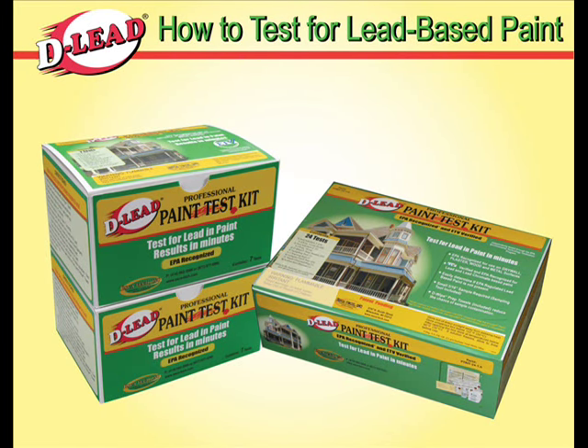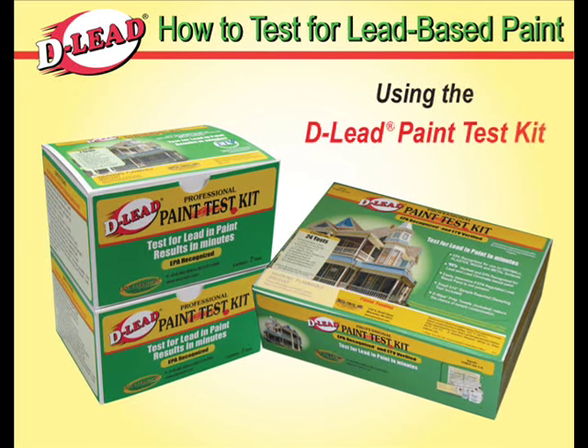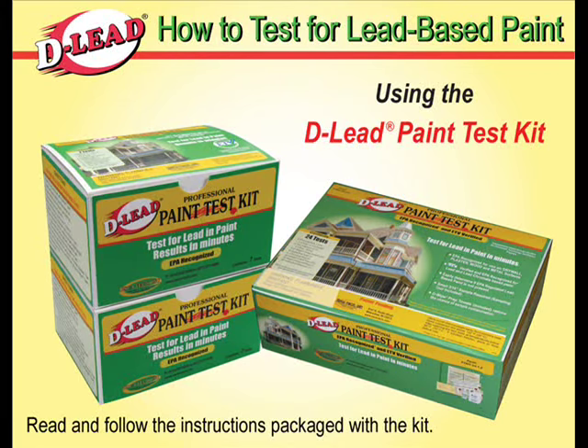This video demonstrates how to test for lead-based paint using the D-Lead Paint Test Kit. Read and follow the instructions packaged with the kit.